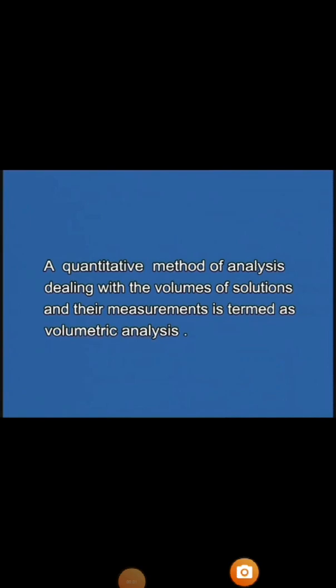A quantitative method of analysis dealing with the volumes of solutions and their measurements is termed volumetric analysis.